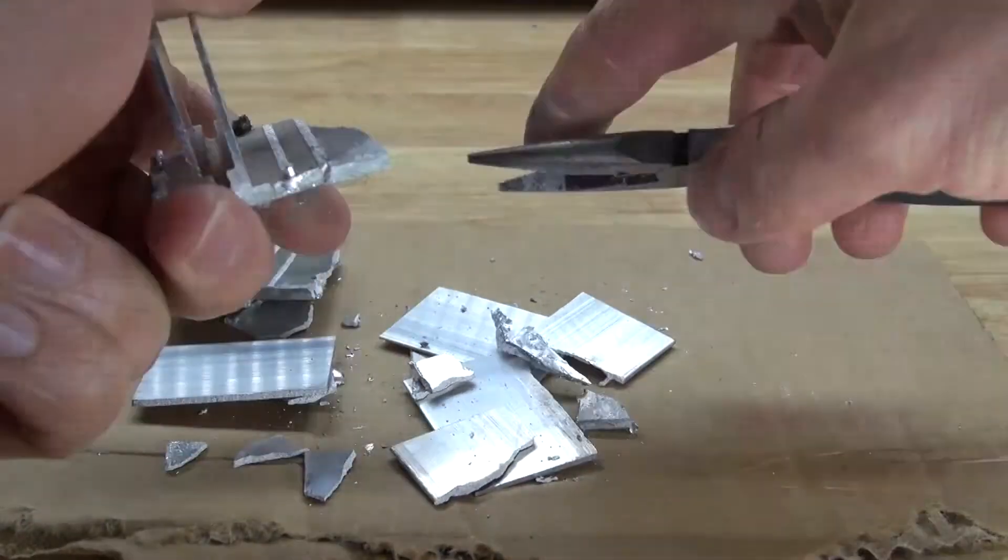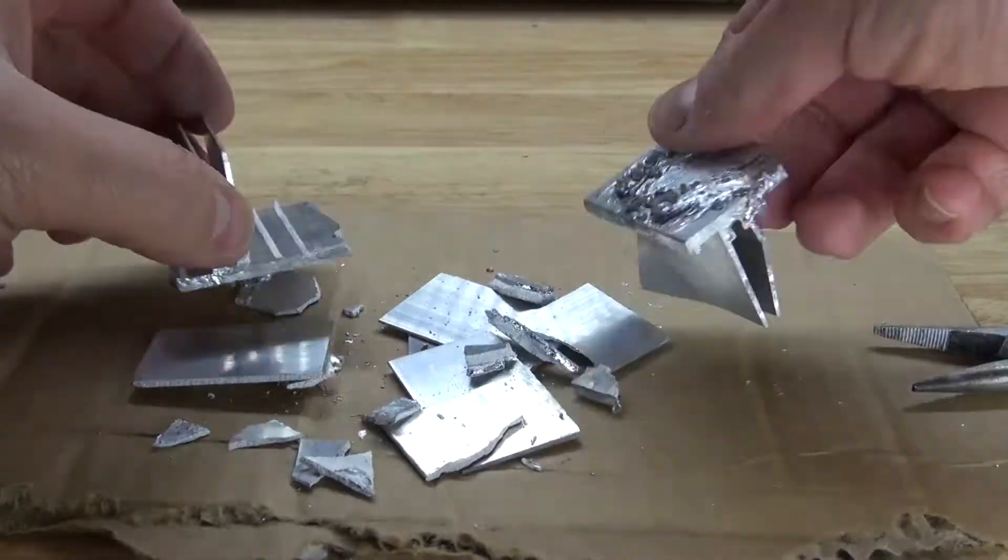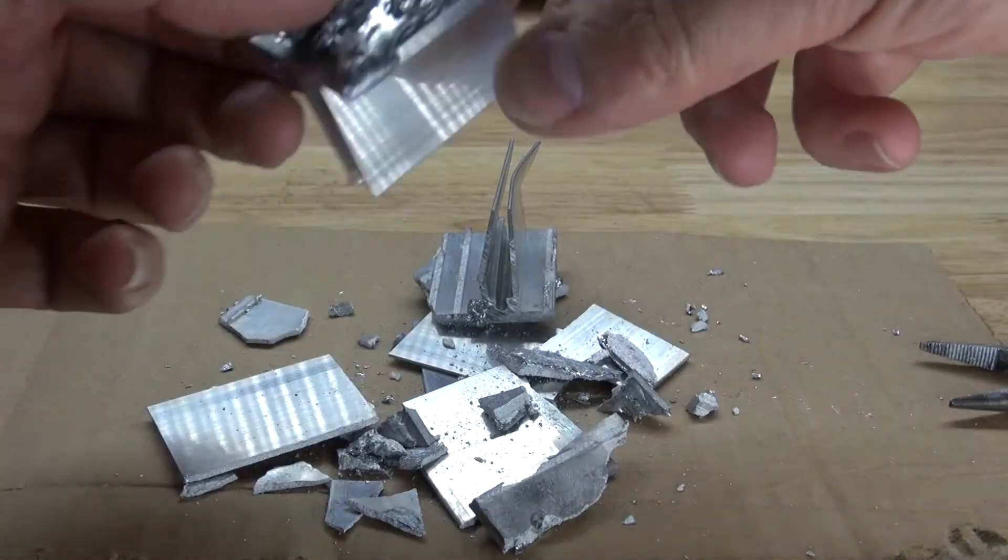Next, I'm going to take some pliers and destroy this heatsink even more. The reason why is so that I can create more surface area to react it with water to be able to release the gallium. Plus, this is also fun.